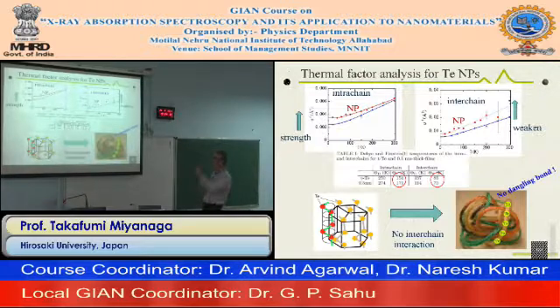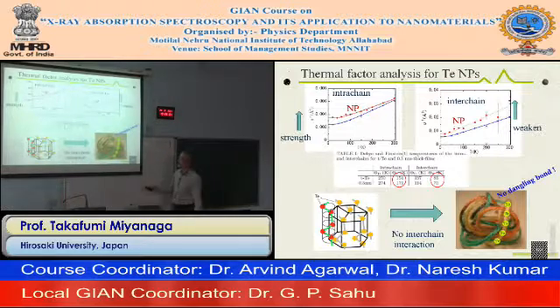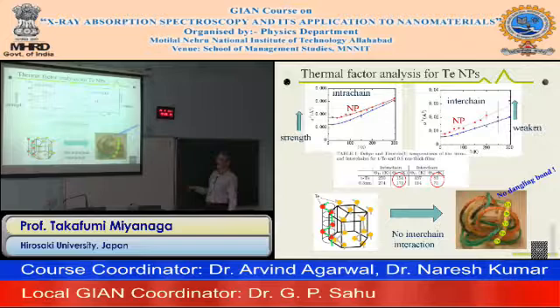Complicated, mixed chains. Unfortunately, we didn't obtain direct information from this type of structure. This is just our explanation, our expectation. My colleague, Professor Ikemoto, studied this type of yarn and discovered the model of the nanoparticles. But it is interesting that in the crystalline state there are many dangling bonds on the surface, but in this case, we hope there are no dangling bonds in the nanoparticles. So different electric properties are expected.